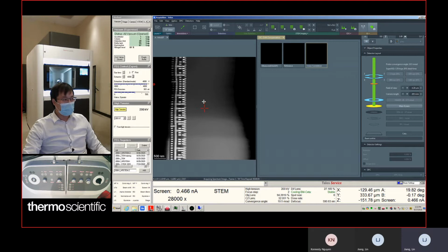We can park a bin here. It's about 10,000 counts, right? It's scanning location. If you scan the vacuum region, you might get less counts because we have vacuum region here. So it's about the same. 10,000. When you reach the vacuum region, you don't have samples, so your count's getting low.